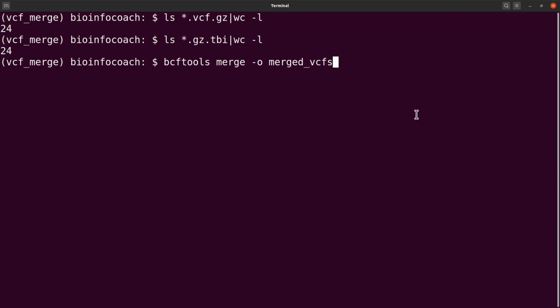And then we add our extension .vcf.gz. So that will differentiate between the other ones here for us. So this is where we do our merging. It's VCF, yeah, so let me correct that. And then we specify this -O z.